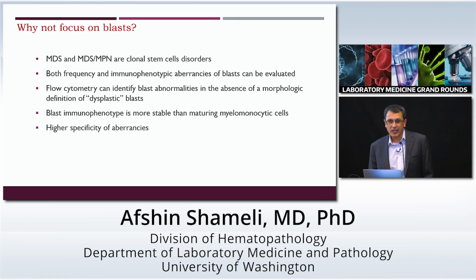Blasts are actually an ideal target for evaluation in the setting of MDS, because MDS and MDS-MPN are clonal stem cell disorders, and blasts are expected to be affected in almost all cases. In addition, both frequency and immunophenotypic aberrancies of the blast population can be evaluated. And flow cytometry can identify blast abnormalities in the absence of a good definition for the dysplastic blast population. We know that blast immunophenotype is more stable than maturing myelomonocytic cells, and they have higher specificity.